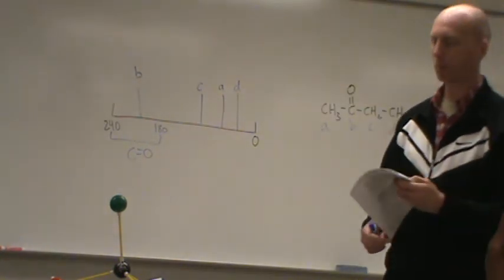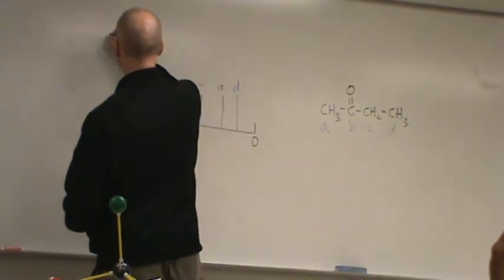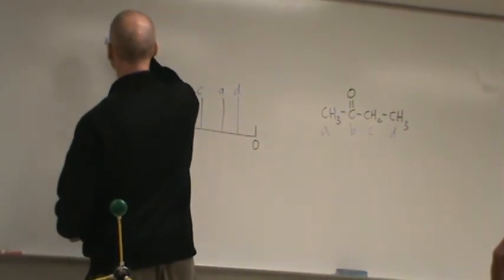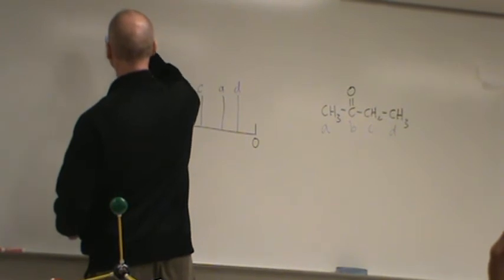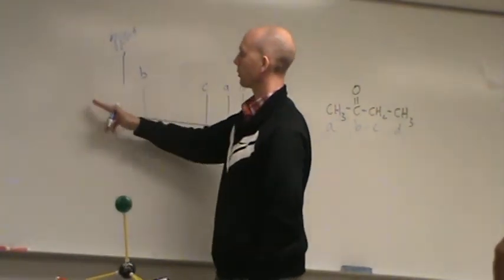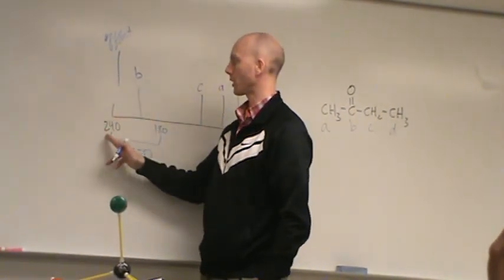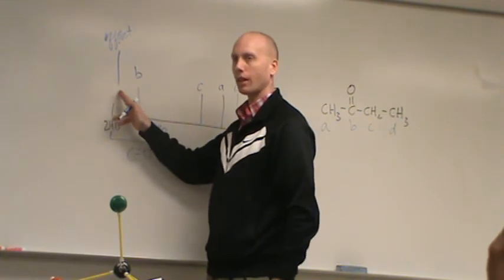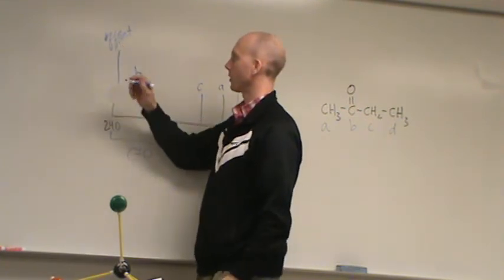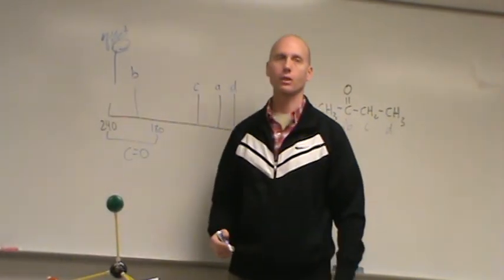An offset peak is where they take a peak that was off the spectrum, more downfield than I'm showing, and bring it on, and it gives you the value right above it, okay?